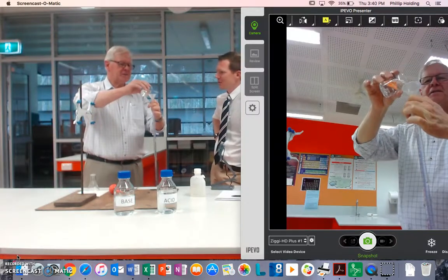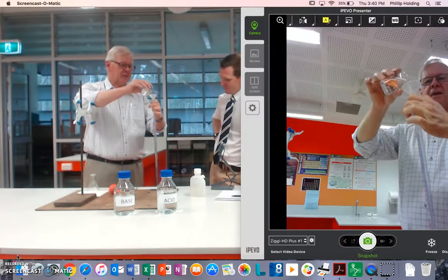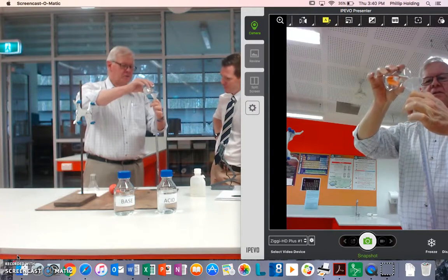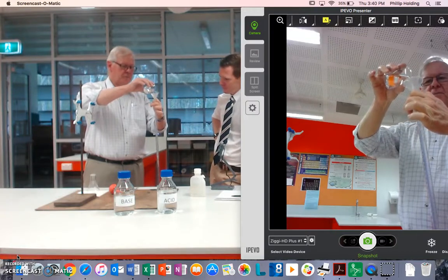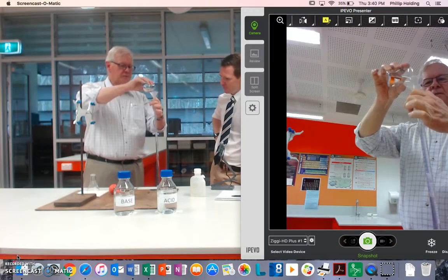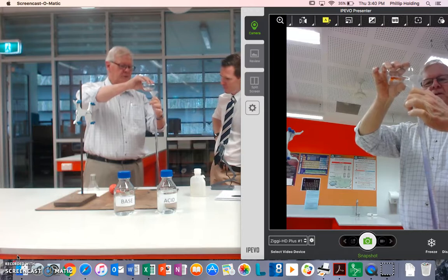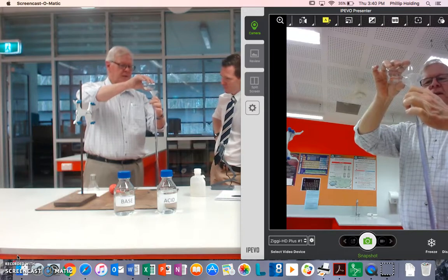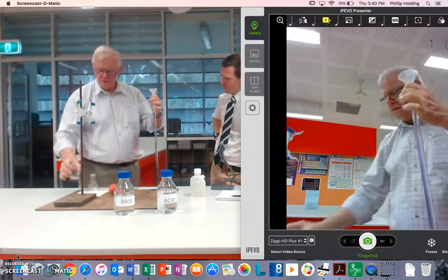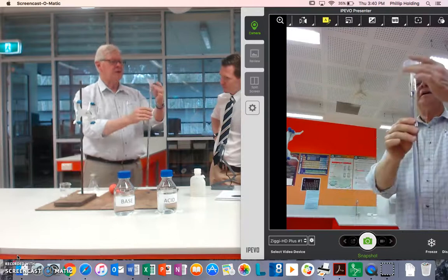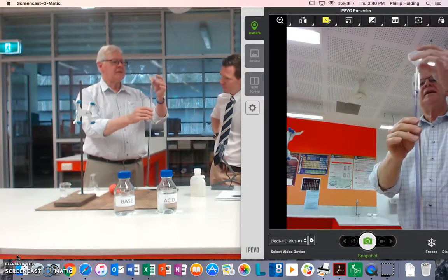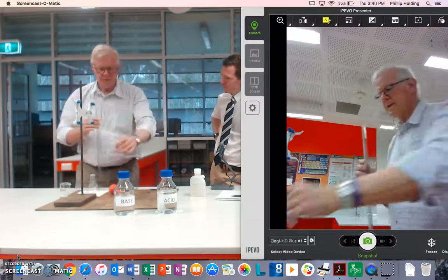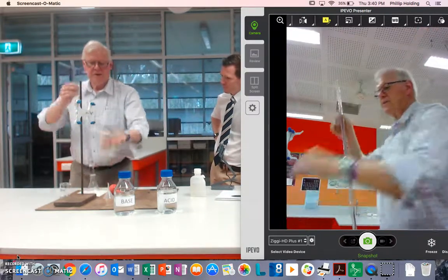Not the best because it's very soapy. And what you do is you fill it up beyond the zero. So we take it right up. Don't overfill, so make sure it's in control. Now, once it's there, take the funnel out. It must come out straight away.